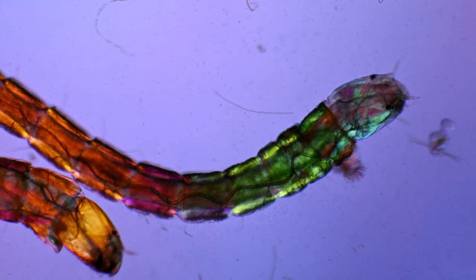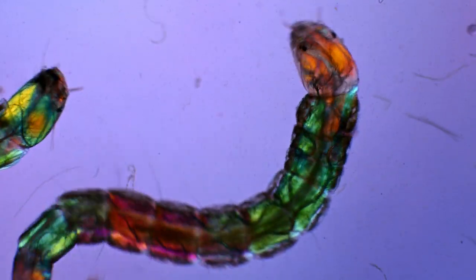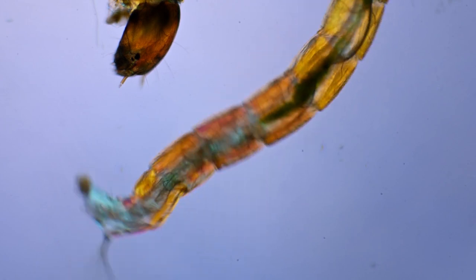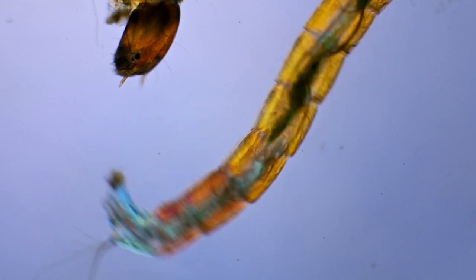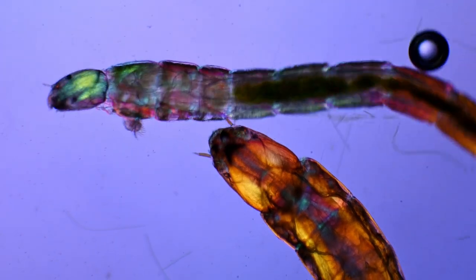Some of the structures that interact with the light are the larvae's muscle fibers. This makes them glow brightly in different colors depending on their orientation in the light. So when the larvae wiggle their bodies, it looks like they are dancing in disco light.